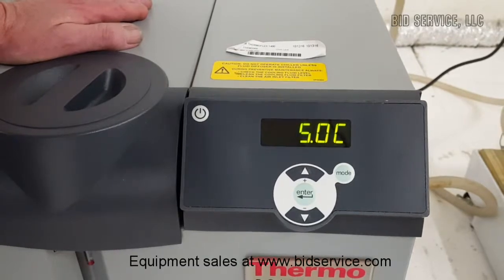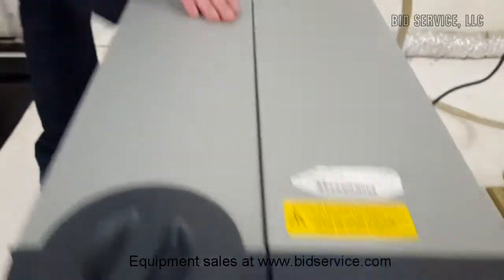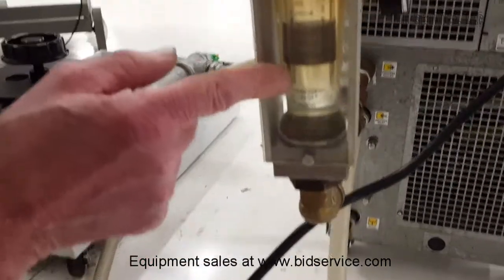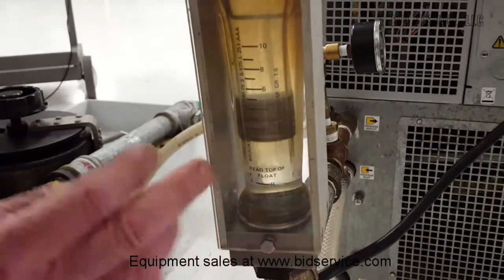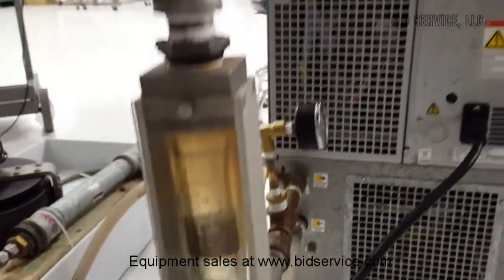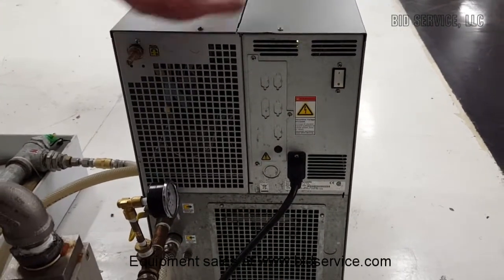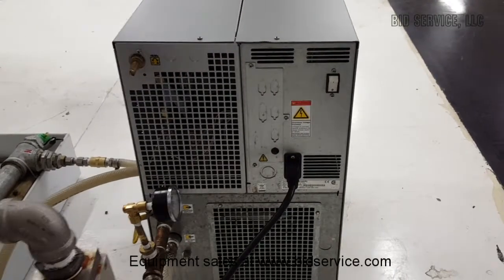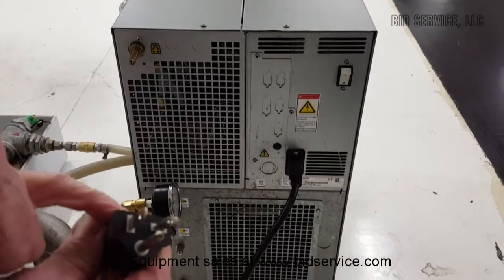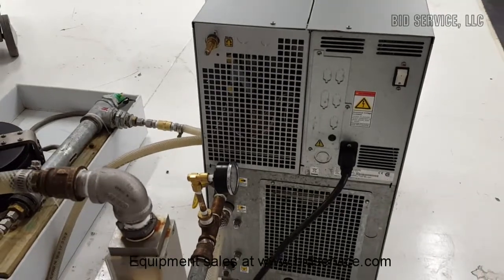It has a specification for flow rate of 4 gallons per minute. You read at the top of the flow meter here — we're at almost 4 and a half, so this is a pretty strong circulator. It is a 120-volt unit from the wall; however, keep in mind that it requires a 20-amp 120-volt plug. You'll notice the pin is turned here, so you will need at least a 20-amp supply.